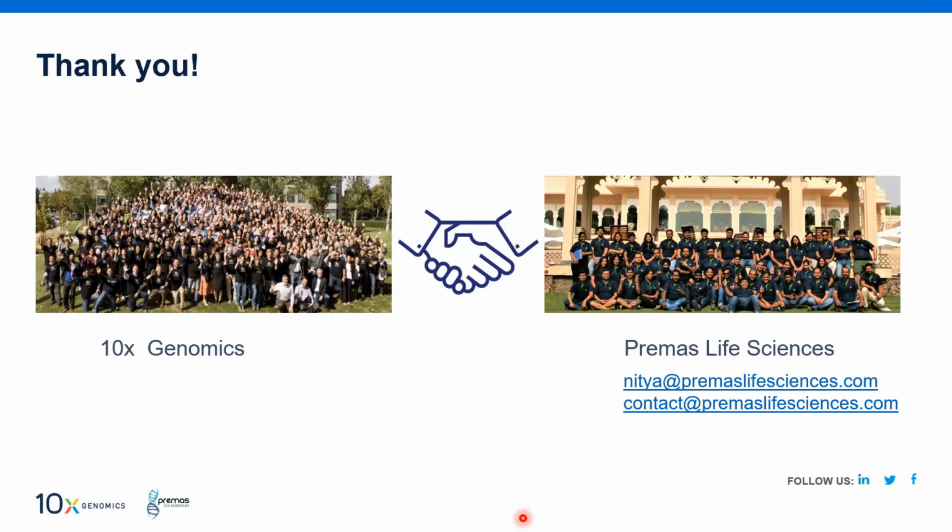You should be aware that the temperature should not cause clumping of the cells, and use the right type of media for processing. There should not be any RNase activity in a particular cell population. That's why you need some specific modifications, because if the cells are like neutrophils, which have RNase activity, that will degrade the RNA during sample preparation itself. So we have to consider those things altogether.